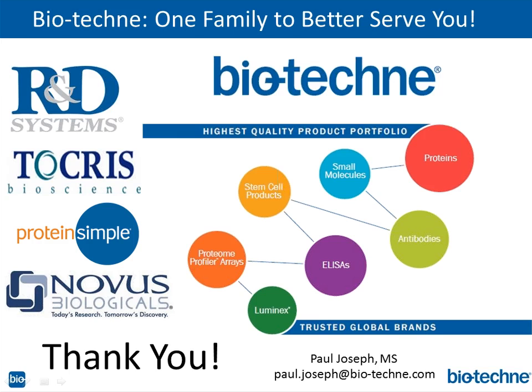We have to be very careful with nitrocellulose. There's that, I don't know what you call it, the Whatman, it's like cardboard. You want to basically store it between two of those. If you email me, I can find the reference for you. But there are ways to do it, and I believe you're going to put it at 4 degrees. I've actually seen membranes stored even at -20, but 4 degrees is standard practice there. If you email me, I can try and find some of those storage conditions for you.